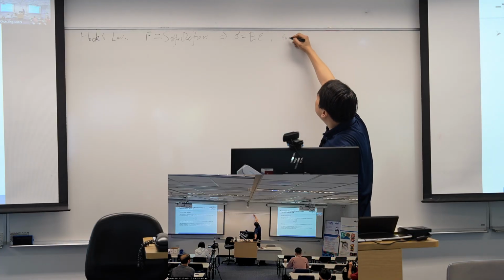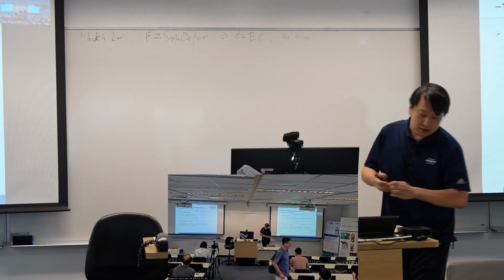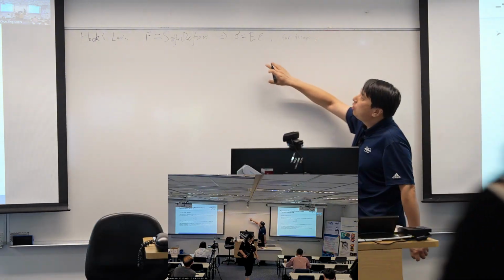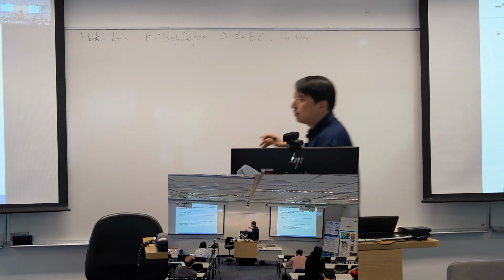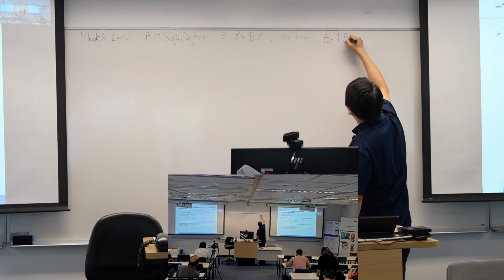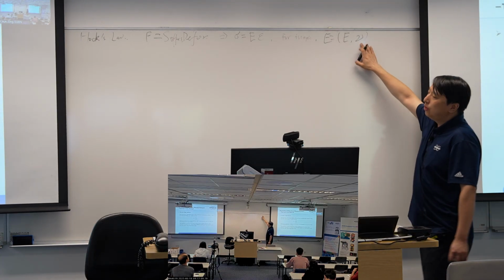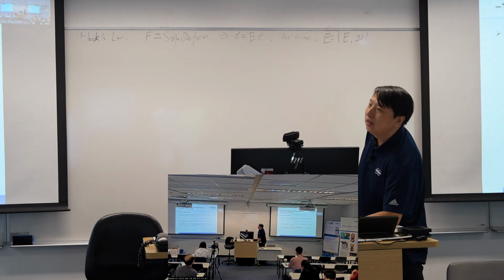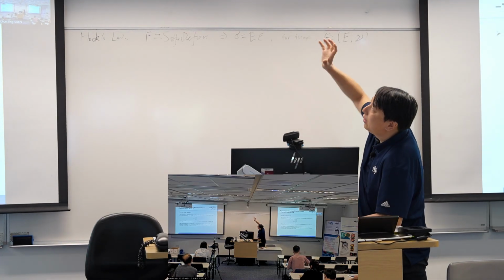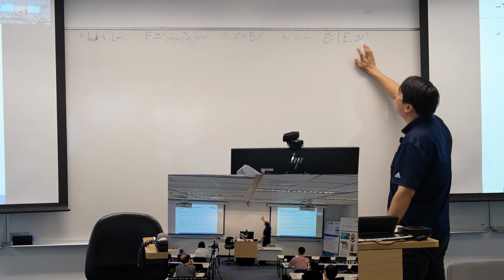And for isotropic material, we can reduce this modulus tensor to only two components. One is the modulus number, and the nu, we call it the Poisson's ratio. It is used to describe the relationship between the direction along the force and the direction perpendicular to the force.